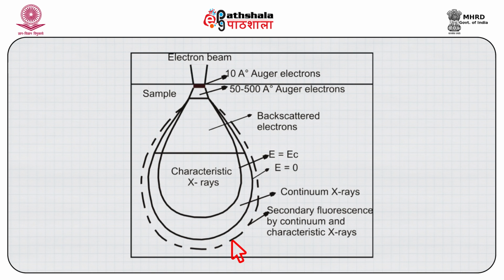So, we see that this complex domain produces different kinds of X-rays. Besides these effects, there is a generation of Auger electrons. Auger electrons occur when an expelled electron from an atom, if it has high enough energy, expels another electron, and those are known as Auger electrons, and that can also be used as a characterizing tool for material.